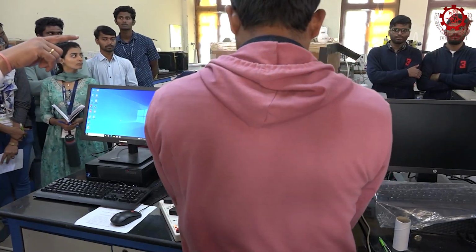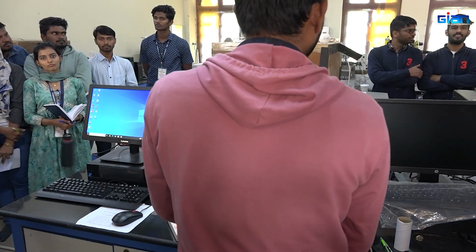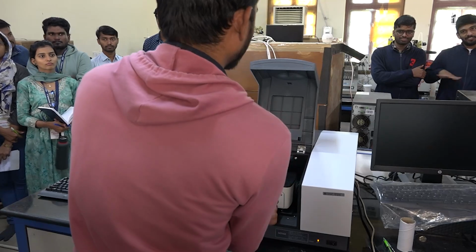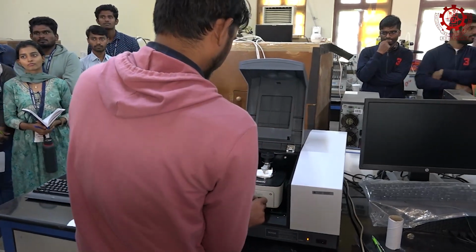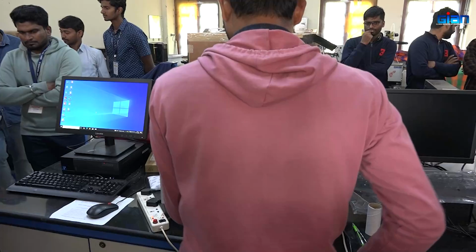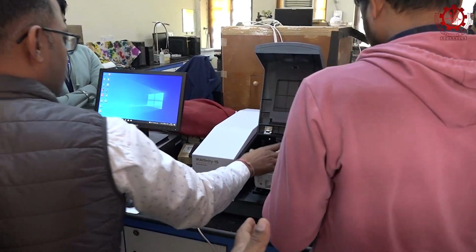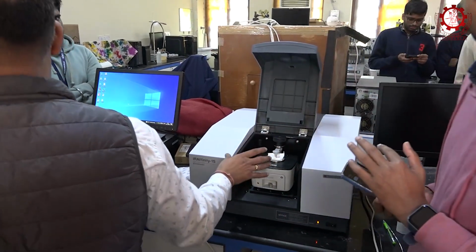You guys don't need, or should we make batches? Okay. You guys maybe can come this side. So now the one we are putting here, you can call it the sample holder.